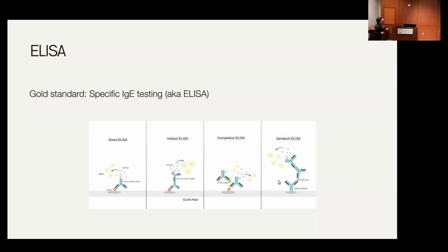And on a final note, I just wanted to reiterate the importance of introducing the enzyme-linked antibody last, because we don't want it to get muddled with all the previous steps. And if you know that the very last step of all of these subtypes of ELISA was the introduction of the enzyme-linked antibody, then these methods, direct, indirect, and sandwich, become really straightforward to navigate.